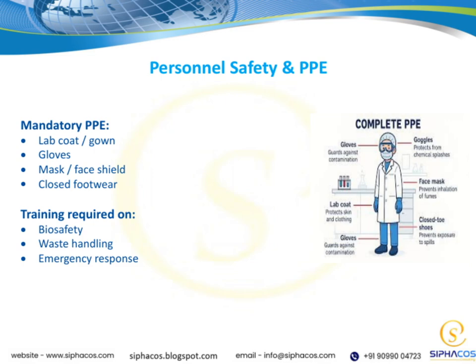A lab coat or gown is critical to protect your clothing and skin from potential spills or splashes. Gloves are also a must whenever you're handling hazardous materials. They act as a barrier to prevent contamination. Masks or face shields are important as well, especially when working with aerosols or infectious agents, to protect your respiratory system and face. And of course, closed footwear is essential to protect your feet from any accidental spills or dropped objects.